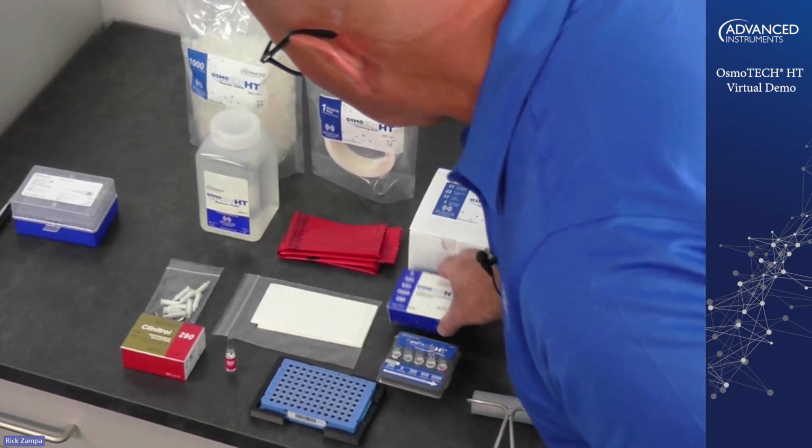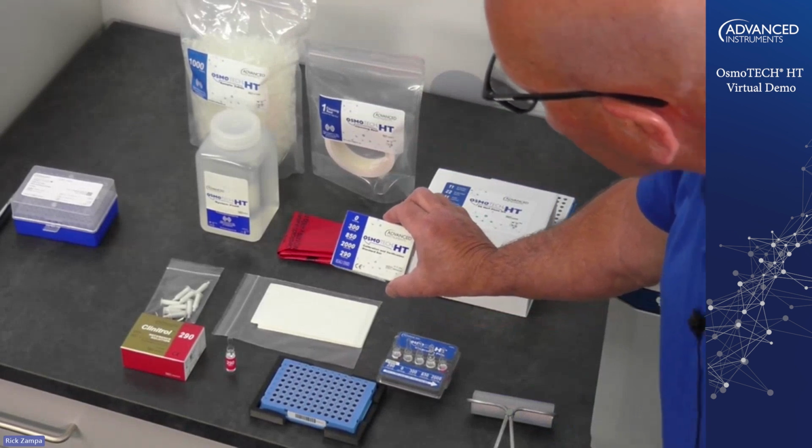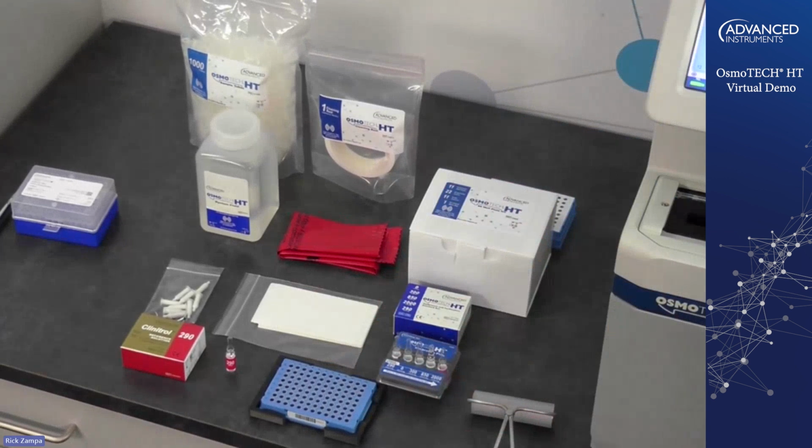We'll talk a little bit more about that. You have a calibration kit here as well, which comes with all the calibrators you need to calibrate the instrument and the reference solution 290 to run the verification at the end. Okay.